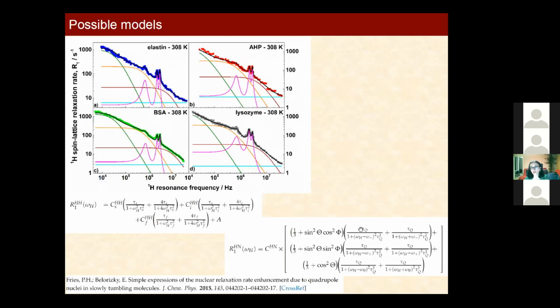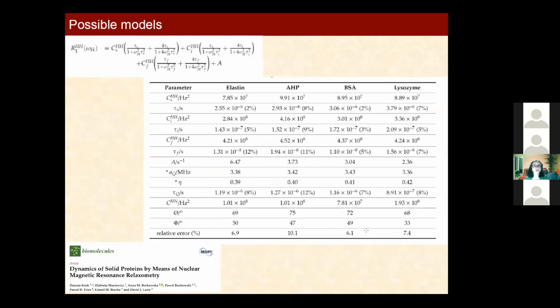And there's a correlation time, tau Q here, which in the original formulation of Pascal was just the rotational correlation time. However, here, without going into much detail, it's a correlation time which characterizes the fluctuations of the quadrupole interaction. That's it. So with those parameters, from the position you just calculate the quadrupolar coupling constant and the asymmetry parameter. One calculates the geometrical parameters.